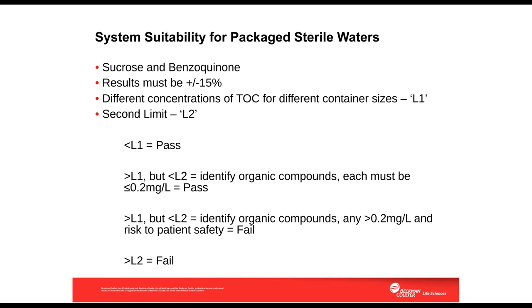If, however, any individual organic compound is found to be present in quantities greater than 0.2 milligrams per liter, then that organic compound must be evaluated for its impact on patient safety at that reported concentration. If it's determined that there's no impact on patient safety, then the water sample meets the requirements, and again, the test is complete. Now, if, however, any organic compounds are identified as potentially harmful and are present in sufficient concentration to impact patient safety, then the water sample does not pass the test and fails.